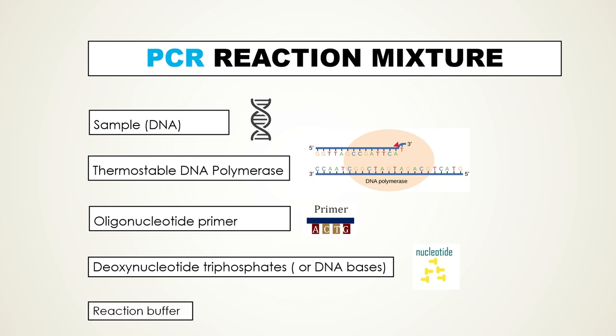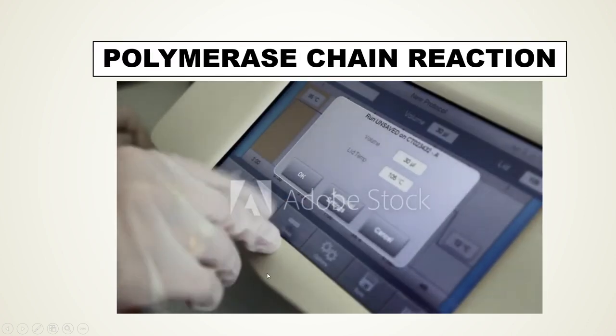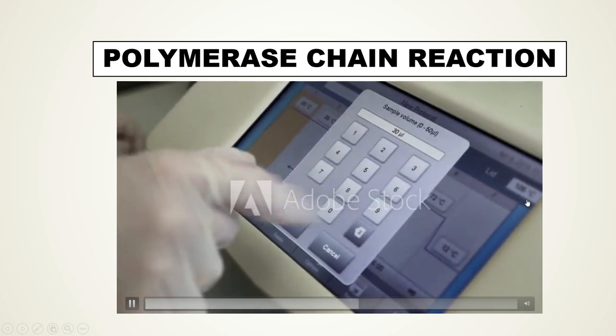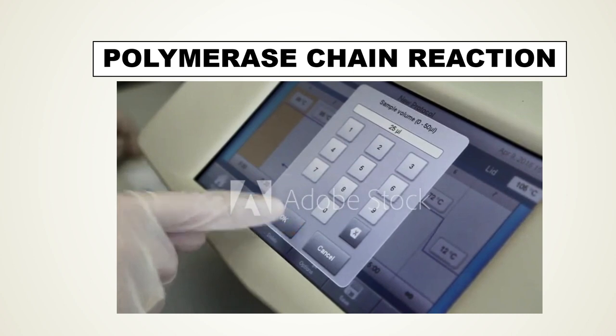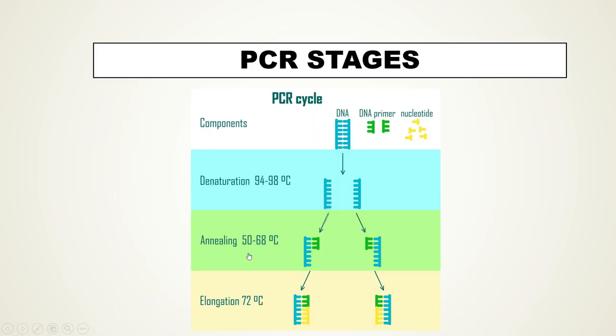Lastly, we need a reaction buffer. In summary, we need a PCR machine called a thermocycler, and a test tube containing a PCR reaction mixture which includes: the original DNA template, thermostable DNA polymerase, oligonucleotide primers, deoxynucleotide triphosphates, and a reaction buffer. The way PCR works is you put all those ingredients into a tube and then heat and cool the tube — this is called a cycle — and after each cycle the amount of DNA doubles.